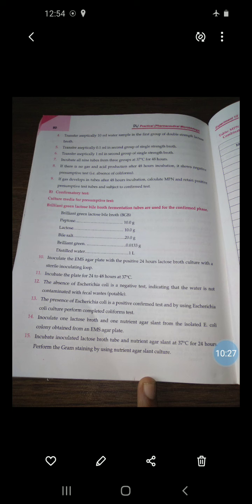Then transfer aseptically 10 ml of water sample into the first group of double strength lactose broth. Then transfer aseptically 0.1 ml into the second group of single strength broth. Next, transfer 1 ml into the third group of single strength broth. Then incubate all samples from the 3 groups at 37 degrees Celsius for 48 hours.